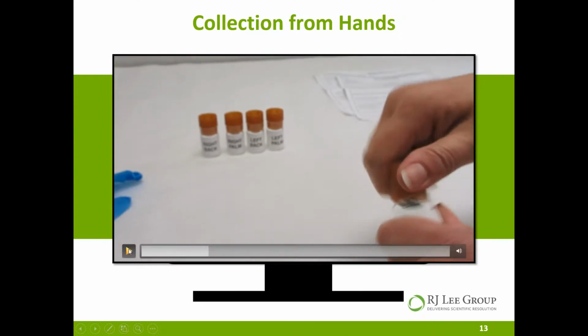If you'll notice what I'm doing here, as I was opening the stub, I'm shaking it back and forth. So you don't want to squeeze too hard on the vial and crack it. You simply want to hold the vial in your hand and rock back and forth to pull that cap off of that vial. So I'm doing that here for the control.